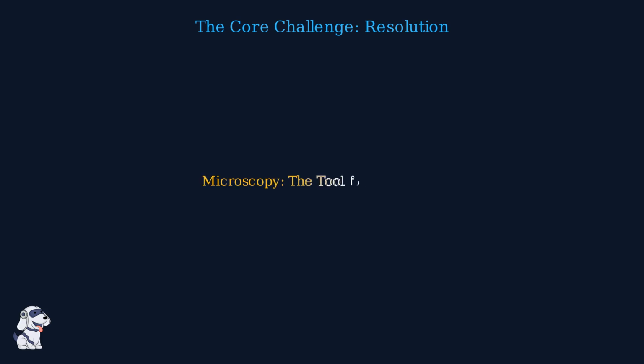To bridge this gap, we use microscopy. By manipulating light, we can push beyond the limits of human vision to resolve the microscopic world.